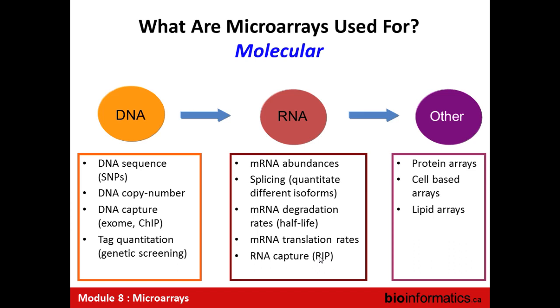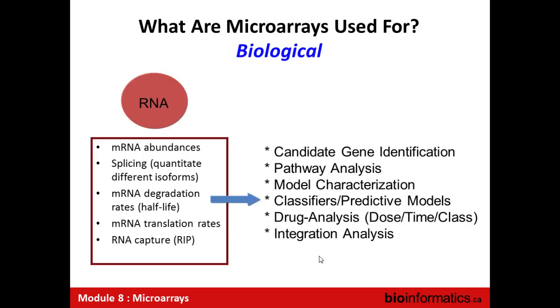So there's a lot of molecular applications, and they lead to a huge series of biological applications, things that you've probably heard about before or will hear about this afternoon. I compare drug-treated to non-drug-treated, or drug-resistant to drug-sensitive tumors, genes that are different like that sensitivity. You can also do pathway analysis.